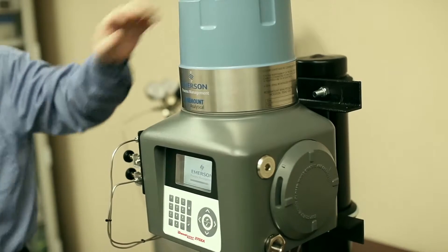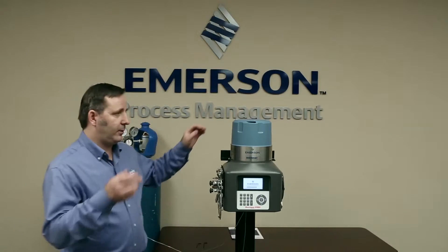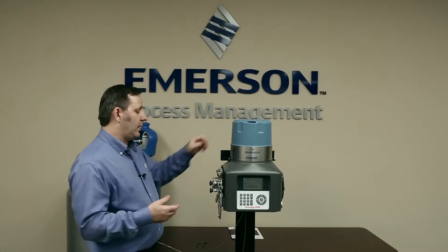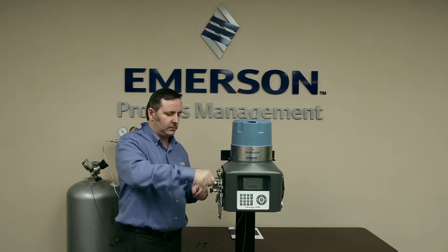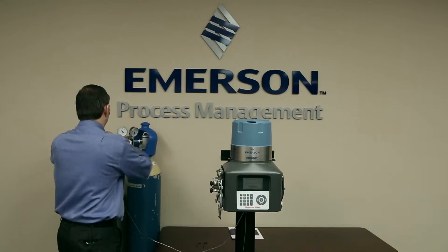So what we have here is the 370XA — it's running at the moment. The first thing we're going to do is take off power. Then we need to remove the gases, so we're going to isolate the gases here on the sample conditioning panel and the carrier gas supply.